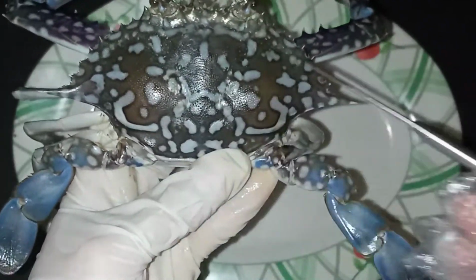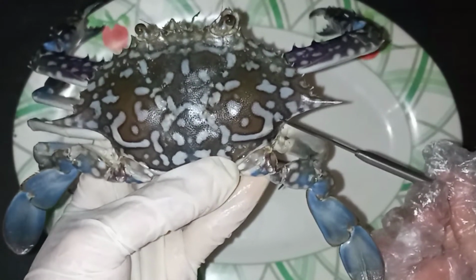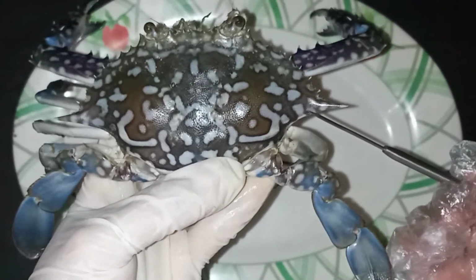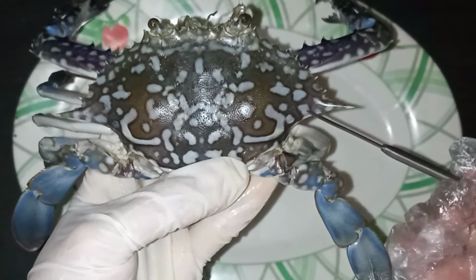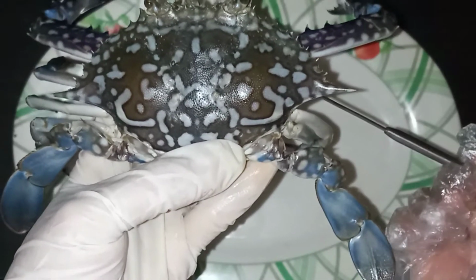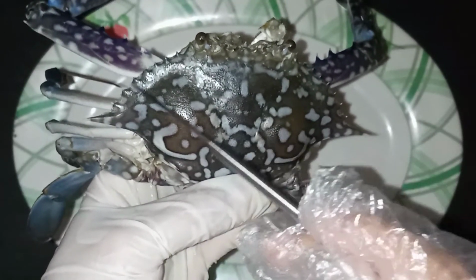These paired points on the widest outside edges of the carapace are called the lateral spines. While these eight small spines are called the anterolateral teeth.